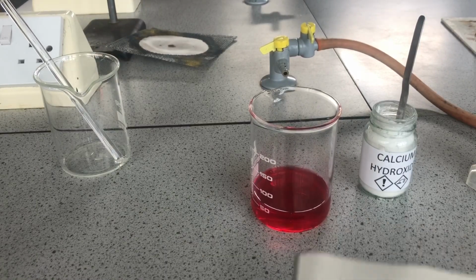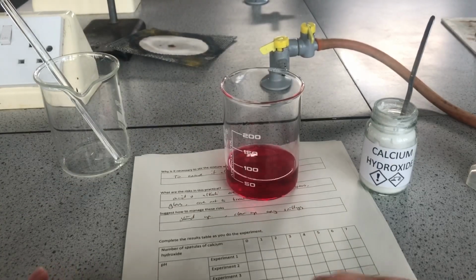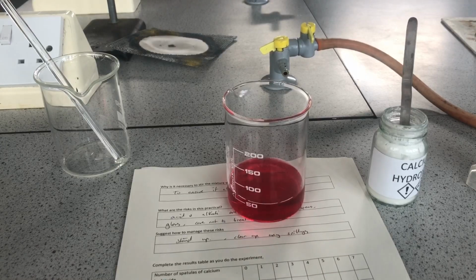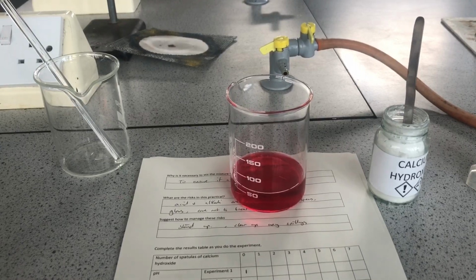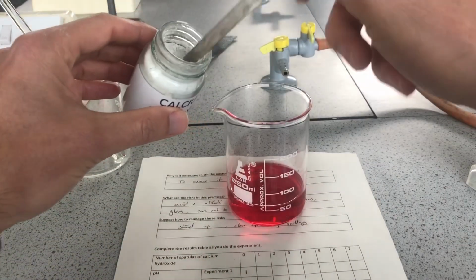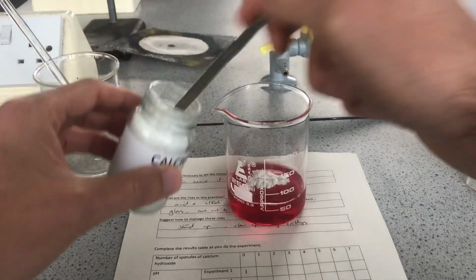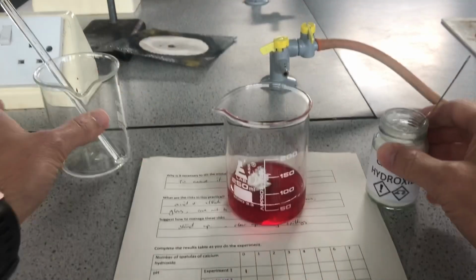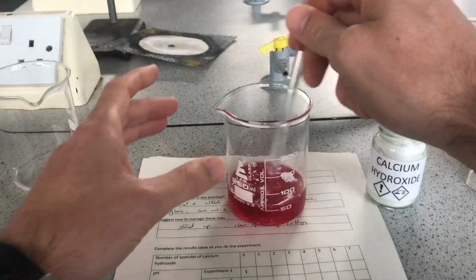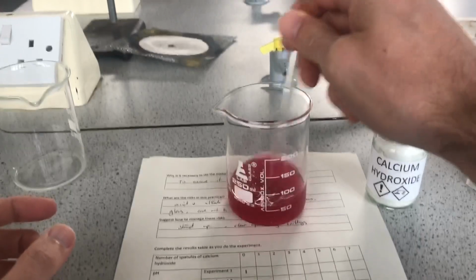So into our results tables, what we'll write here is there's no calcium hydroxide added. pH is 1. Right, so we're ready to start the experiment. What we're trying to do is use even spatulas of alkali every time. So that's our first spatula of calcium hydroxide added, and we'll give that a stir up because we want all that powder to react. It's important it gives it time to react.